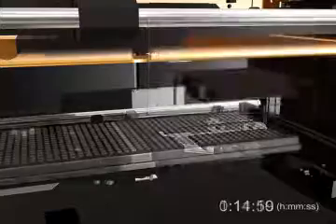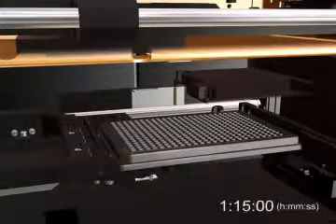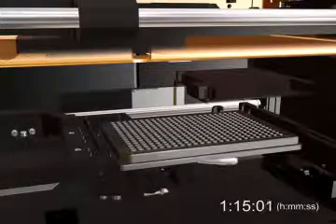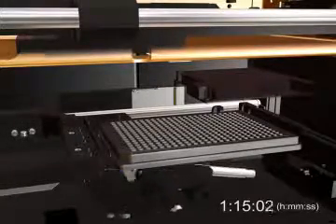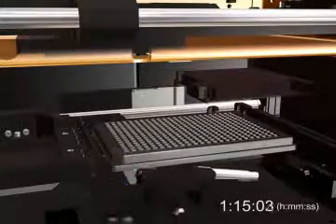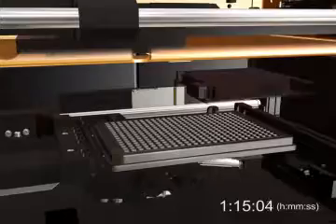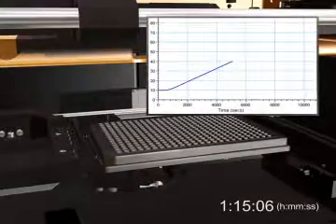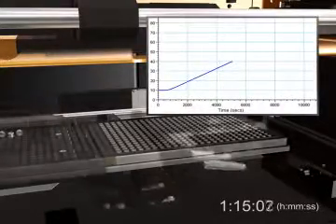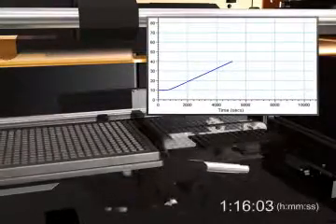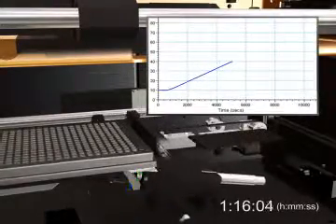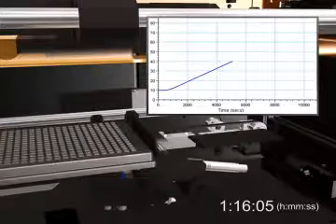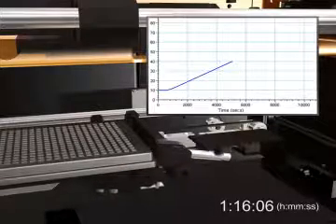The kinetic assay featured here uses fluorescence and is read from the bottom, but on the FlexStation system, kinetic reads can be performed using any detection mode. Plates can be read from the top or bottom, depending on your application.